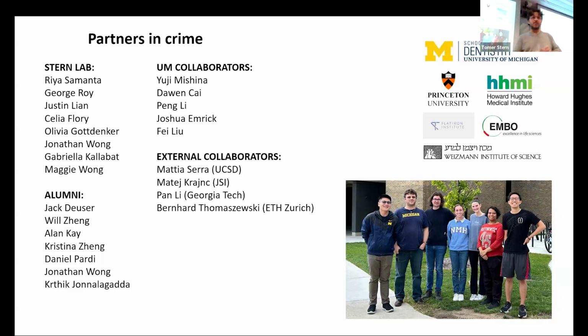I guess the big breakthrough with segmentation, especially in 3 dimensions, was the U-Net and deep neural nets, right? And ImageNet and that kind of thing. So I was wondering how that fit into your thinking. Right. So today, Cellpose and others are doing fantastic work. But when I say fantastic, I mean it's amazing compared to what people did before, but it's really still far from having single cell resolution accuracy. What we do is we're not trying to compete with them in this area.